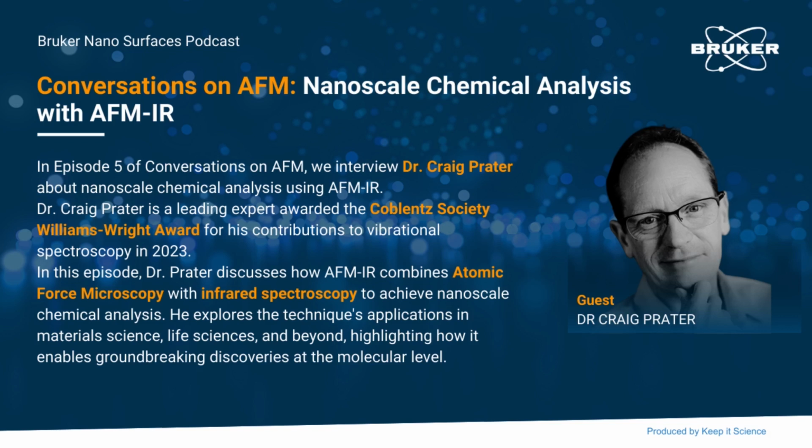Awesome. So we really dive straight into the topic, and we first want to learn a little bit more about what is AFM-IR, because we know that AFM is a really broad topic. And in previous episodes of this podcast, Conversations on AFM, we have explored different subtypes of AFM to study biological and electromechanical features. But today, we really want to explore a slightly different aspect of it, which is, as I mentioned, AFM-IR. And this is to provide nanoscale insights about chemical information. So, Dr. Prater, you have been an absolute pioneer with this, and you have really led the commercialization of AFM-IR. So it would be great to learn a little bit more about what is AFM-IR and how does it work?